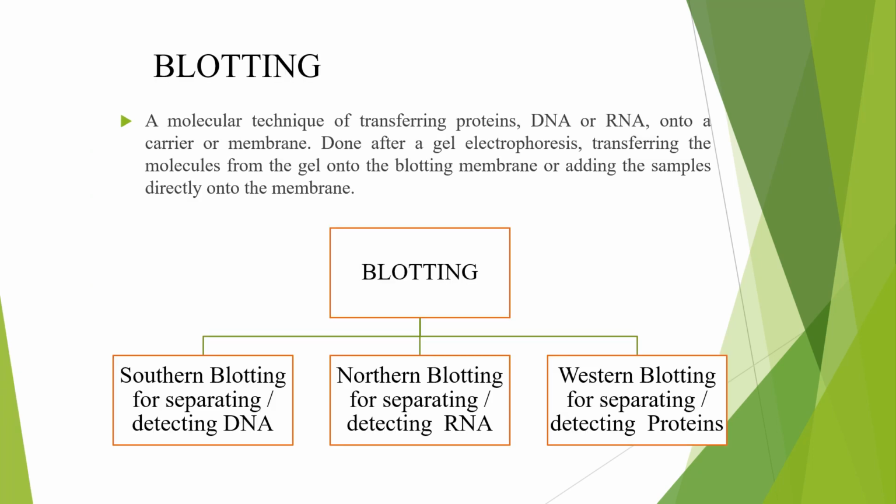Definition of blotting: it's a molecular technique of transferring proteins, DNA or RNA onto a carrier or membrane. This is done after gel electrophoresis, transferring the molecules from the gel onto the blotting membrane, or adding the samples directly onto the membrane.